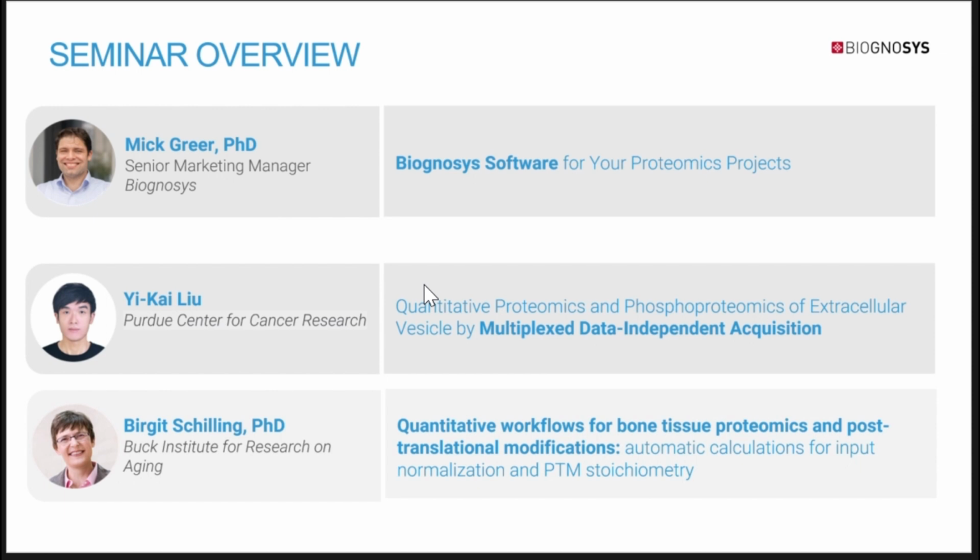I'd like to first start the seminar by giving a quick introduction to our software products, and then we'll hear from Ikai about multiplexed DIA analysis using Spectronaut for phosphoproteomics of extracellular vesicles. Then we'll hear from Birgit to discuss quantitative DIA for bone tissue and PTM analysis.